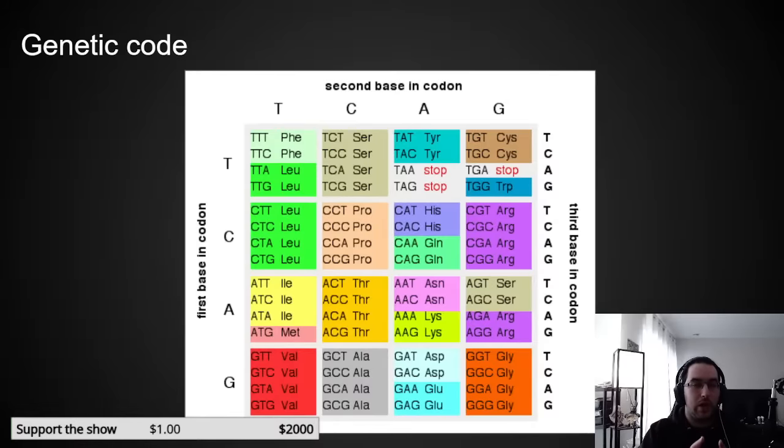So generally, you've got the ribosome binding site, and then there'll be a little spacer, and then you'll have ATG, and that's where the actual protein starts. For stop codons, there's actually three of them. And you'll see this when we get to the coding part, but it's generally helpful to include more than one of them. So whenever I'm doing code, I'll include three. Sometimes I'll include six if I'm really paranoid, but generally two is sufficient. You know, three is overkill and six is absurd. But you'll include two or three of these.